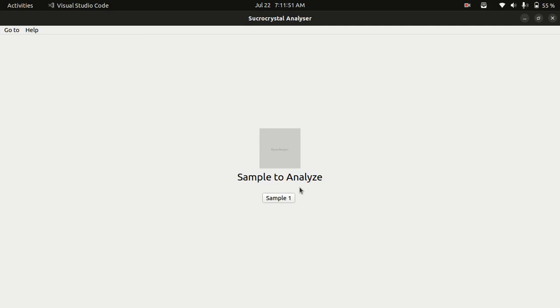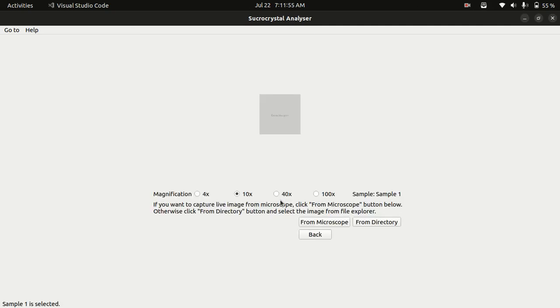So for example if I select sample 1, it will take me to this page where it is asking me to select the magnification. Here are general magnification values which are generally available in all types of microscopes.